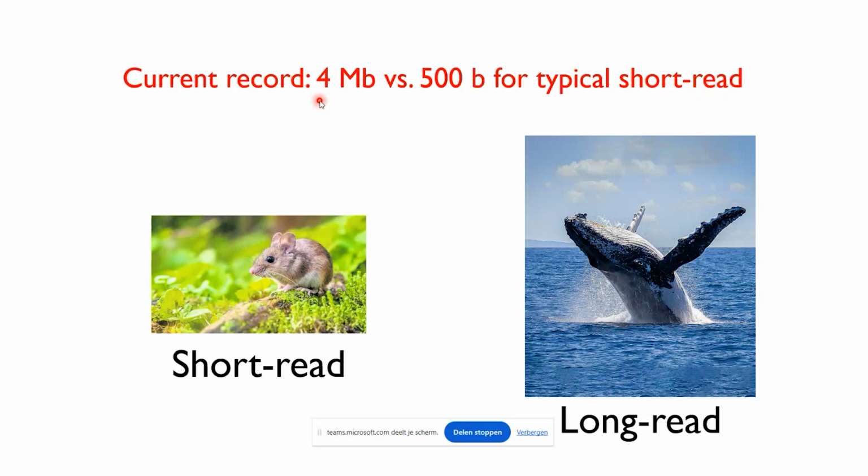If you could isolate a whole chromosome in its entirety in a way that is sequenceable, you would be able to sequence it beginning to end. That's the theory. However, there are always practical constraints. For now, the record is 4 million bases, and there are labs and researchers who make it a sport to beat this record.